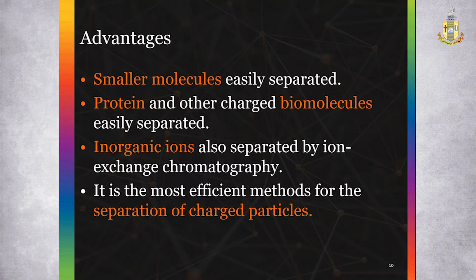Advantages. Some smaller molecules are separated. Proteins and other charged biomolecules are easily separated. Inorganic ions are also separated. It is the most efficient method for the separation of charged particles.